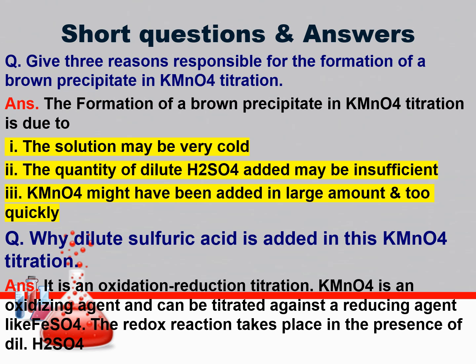Give three reasons responsible for the formation of a brown precipitate in KMnO4 titration. One: the solution may be cold. Two: the quantity of dilute sulfuric acid added may be insufficient. Three: KMnO4 might have been added in too large an amount.